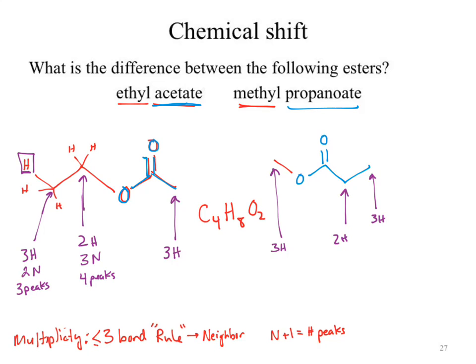Next one. So we're looking now here. It has 0 neighbors, which means 1 peak. Move to the other side, what are we going to notice? Not no peaks, no neighbors. It's okay. It's easy to make. Is that problematic? Same. It's the exact same splitting pattern.